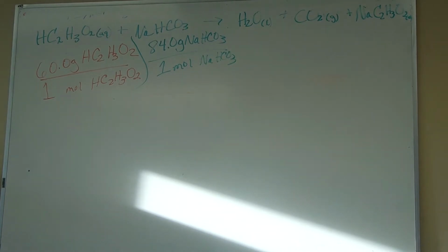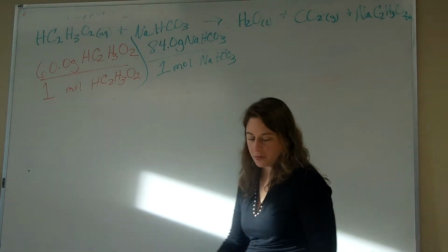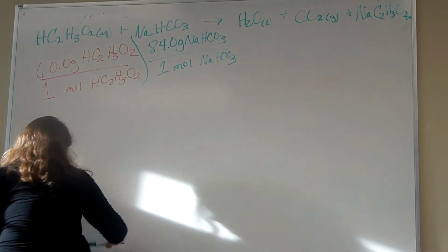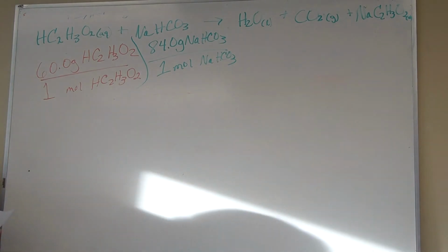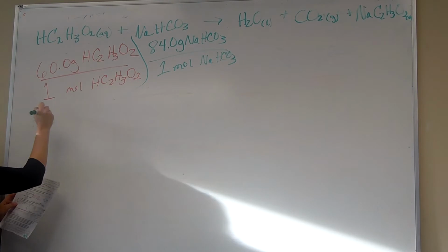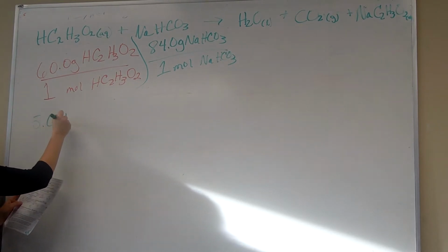So get 40 milliliters, which is 40 grams because the density is about 1. Everyone can measure out your 40. And I'm going to put the math on the board for how to do that. Because we're using a percent, like the vinegar says on the bottle, it's a 5% solution. So we're going to say right here, that's 2 significant figures.